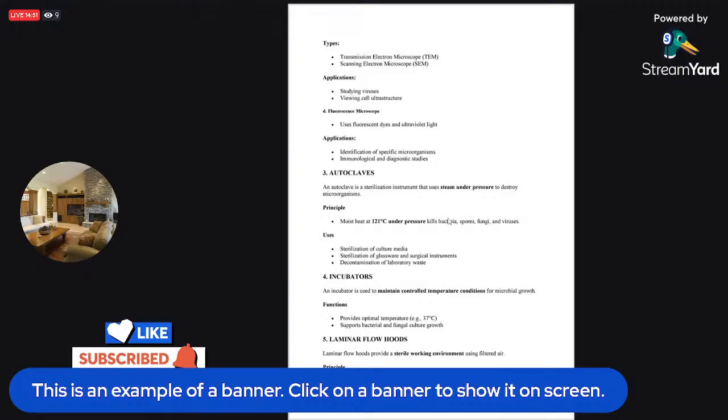So just like when you want to domesticate, let me say, a wild animal, that means if you are bringing that animal to your house, you should be able to maintain that animal so that it will continue to live in an environment that will still look as if they are still in the jungle. So the food of microorganisms are called the culture media. This culture media is going to supply them with the most important nutrients that they will need.